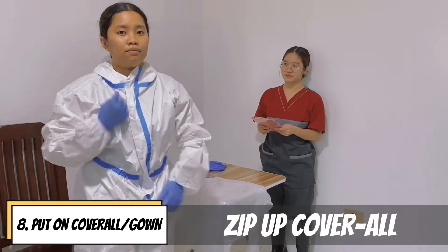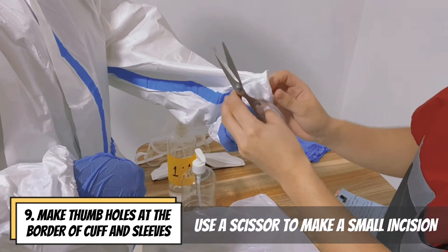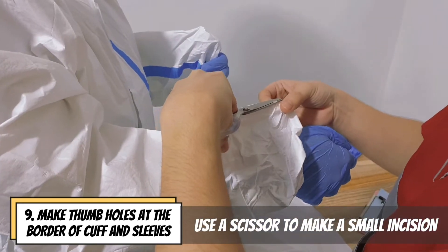Zip up the coverall. Make thumb holes at the border of the cuffs and sleeves using a scissor.